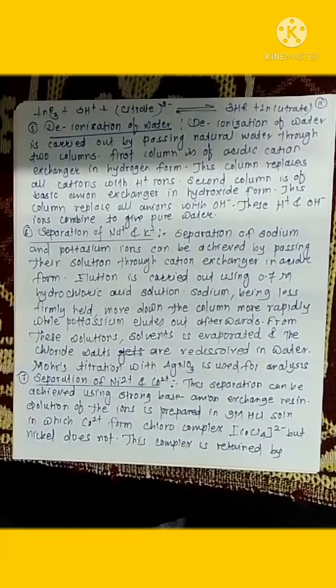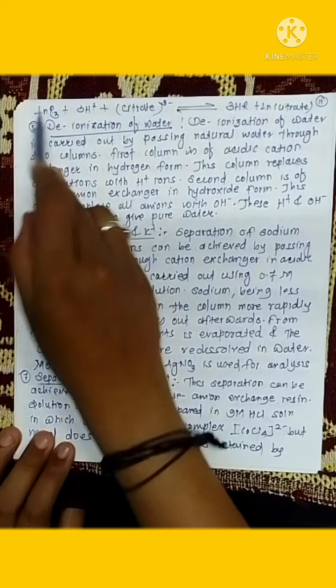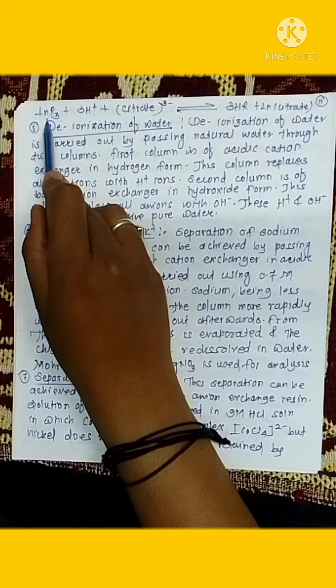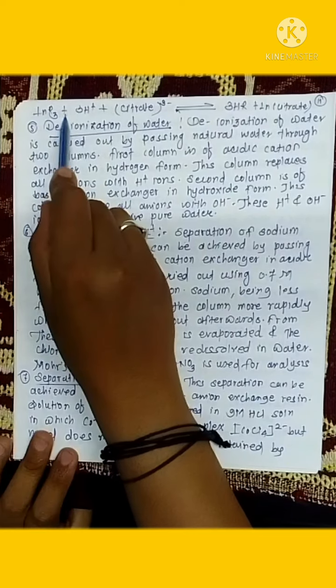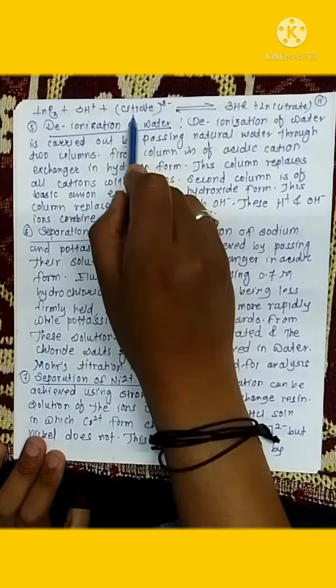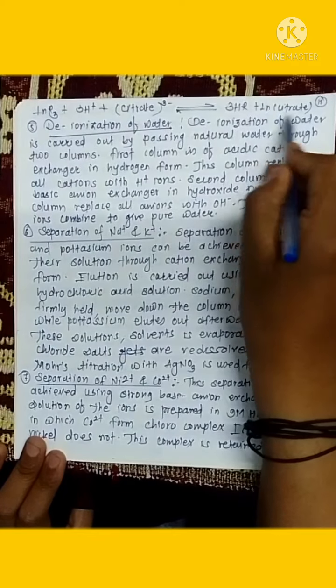So just see here, this resin which is attached with lanthanide, it is reacted with citrate buffer and it forms a complex.